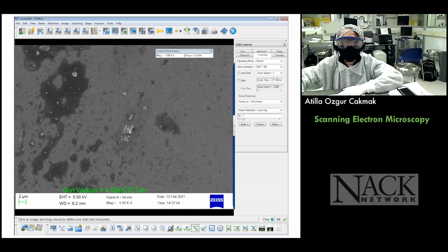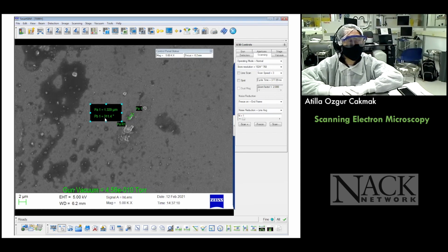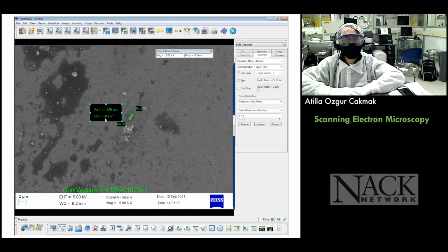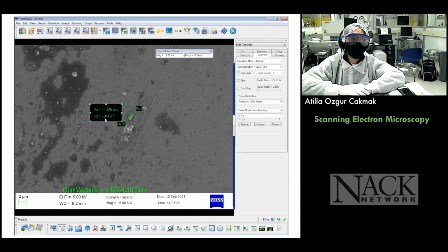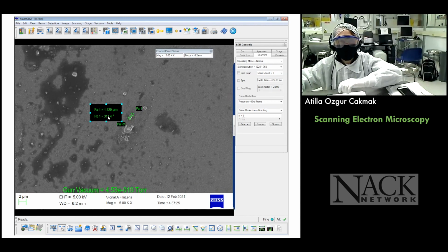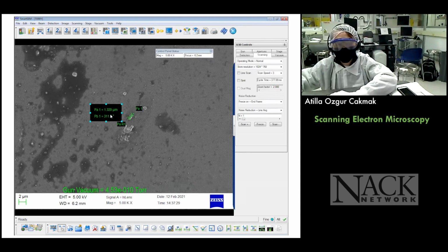So I clicked on that, and this was the one that you were trying to measure, and we end up with 1.3. So that's why we say it will be great if you have an external mouse. I always remind the instructors when we're doing it from a classroom environment. But yeah, sometimes we have a glitch, sometimes not, but it runs similar to this.